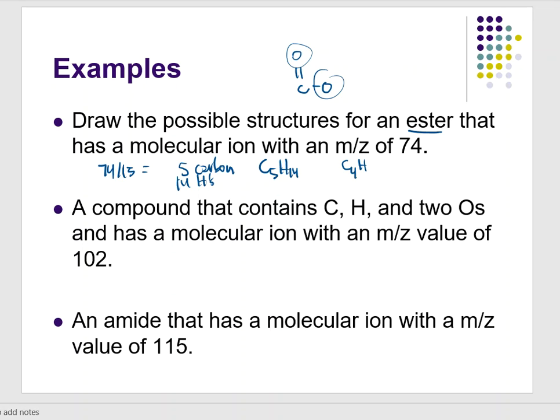I'm going to take away 4 hydrogens to give me a freed up 16 in total. So that's 10 with an O group. But this requires another oxygen here, right? So now I'm going to have to free up another 16. So I'll go to 3. I'll take away another 4 right there, which will give me a 6, and that gives me an O2.